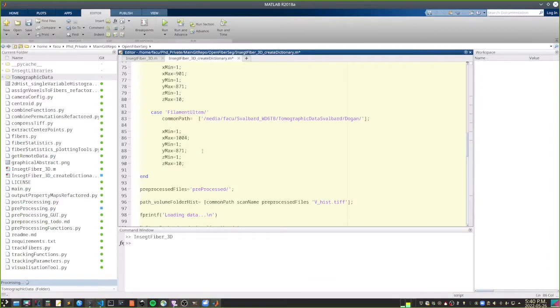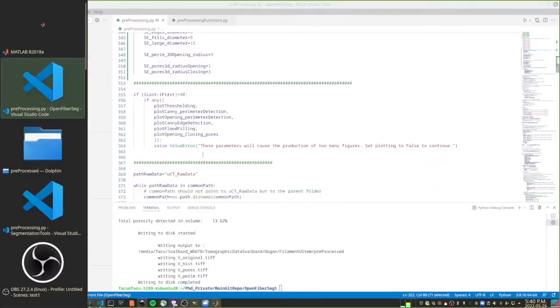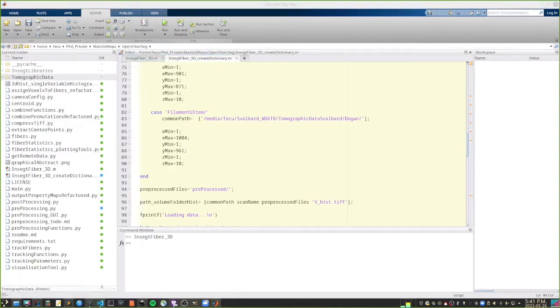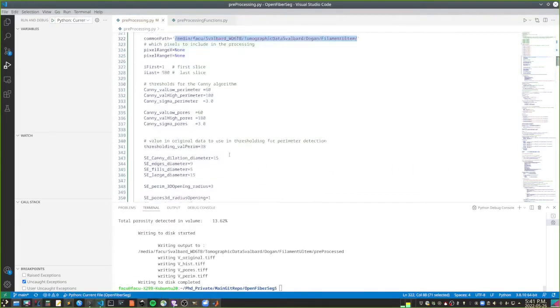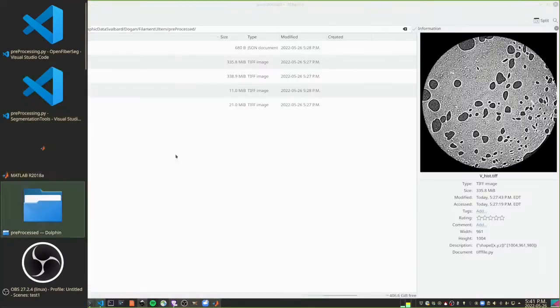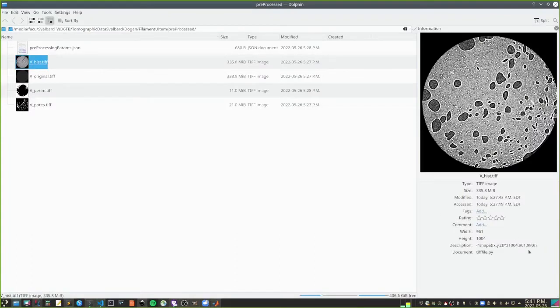1004. I think two dimensions are for the TIFF file dimension, but I don't know the third dimension. How are we gonna find it? Well, you can see that, and we used it before: the Z dimension is going to be what we use here. It has to be, because that's how many we processed. And when we look here, it's 980. Yeah, true.